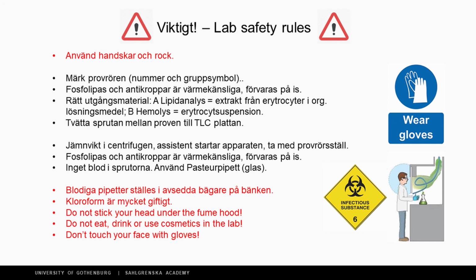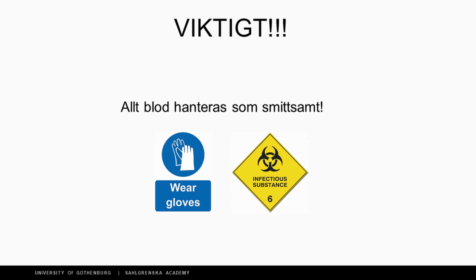In this lab, for the TLC part, you will use chloroform as a solvent. Chloroform is very toxic, and you have to make sure that you always work under a fume hood when handling chloroform, and that the fume hood is always properly closed. When working with blood, you should always consider the blood an infectious substance.